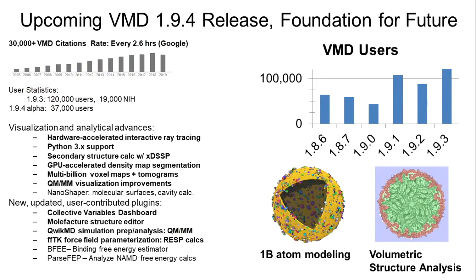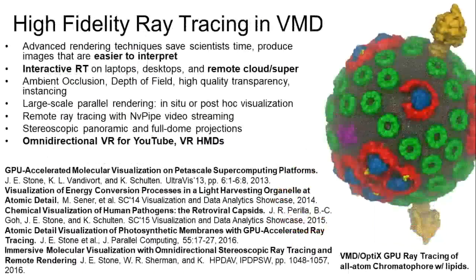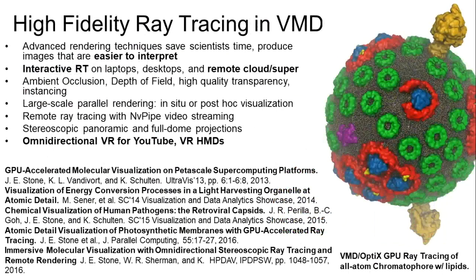We now have formalized this mechanism, and it is pervasive throughout VMD, and allows anyone to expand the program's support for different file formats, to develop specialized tools to do different kinds of analysis. And so just to give you a few examples of those, I'll show you in a few slides some of the ways those are implemented.